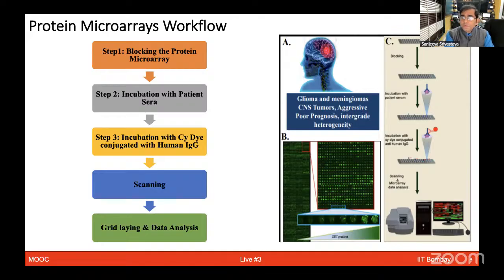So I'm now going to give you a short video demonstration of how we have used peptide microarrays during the COVID time, but for that matter, this can also be utilized for any other applications. I'll now play this short video, and then we'll go to the lab.